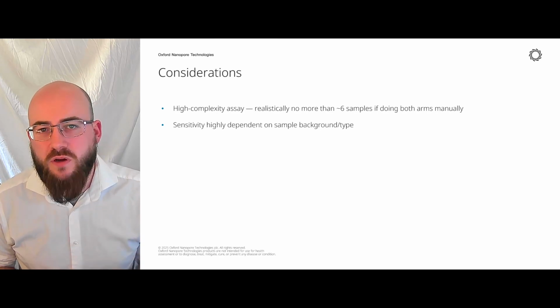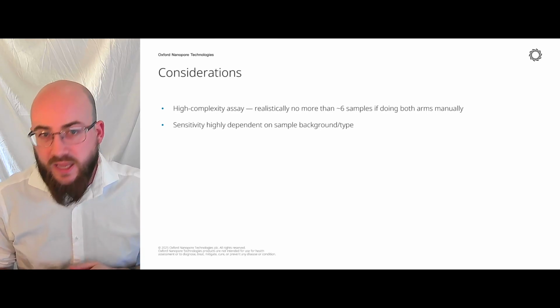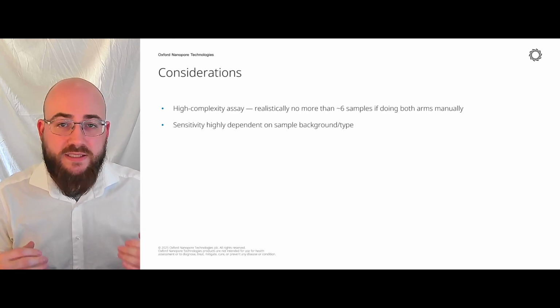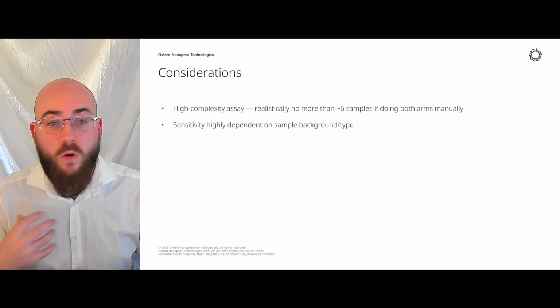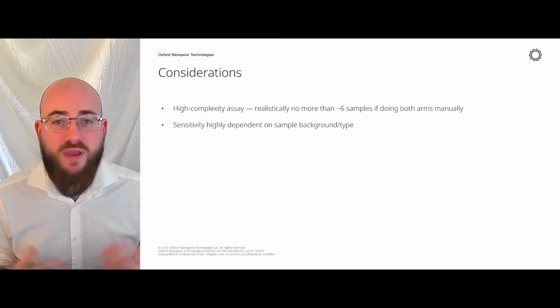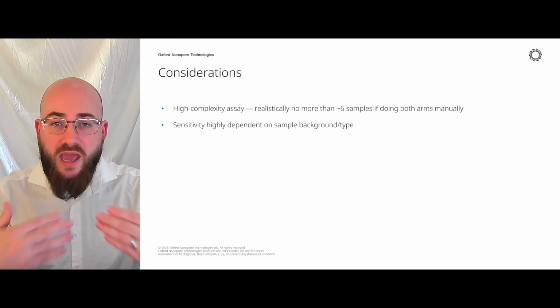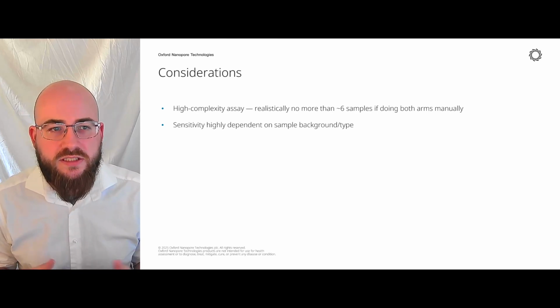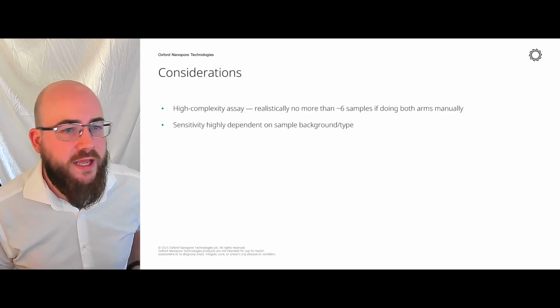So I wouldn't be trying to do too many of those at once. If you want to do more, and you can be flexible, of course you could prepare some and then prepare more later. If you're in a real rush and need to get things out, we have that flexibility to prepare a few and start sequencing them early. So it's up to what you need to do, but that's a recommendation I'm going to throw in here.